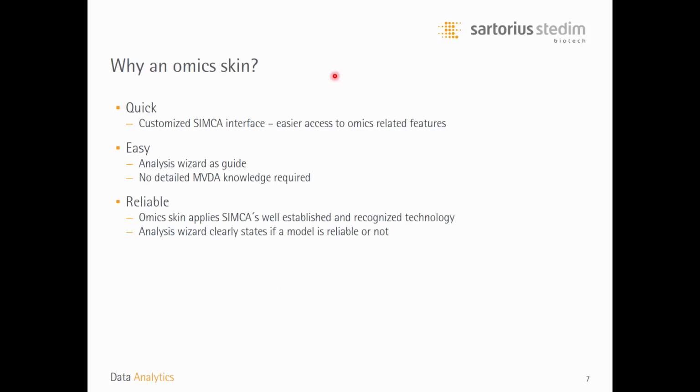So why have we then developed an Omics Skin? Well, the reason is that we want to simplify the use of the SIMCA software and make tools for omics data analysis more easily and more readily available to people that have an interest in analyzing omics data.